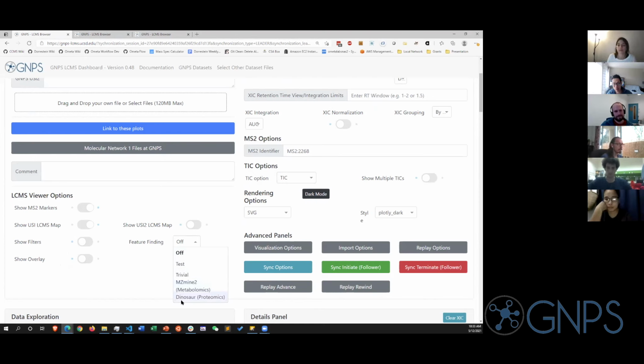Additionally, our thought process here is it allows you to explore your data quickly and optimize some parameters quickly. We include MZmine specifically here because you can do it for one file, and then we have a downstream workflow where you can do it for hundreds and thousands of files, right? That's the scale that we personally operate in.